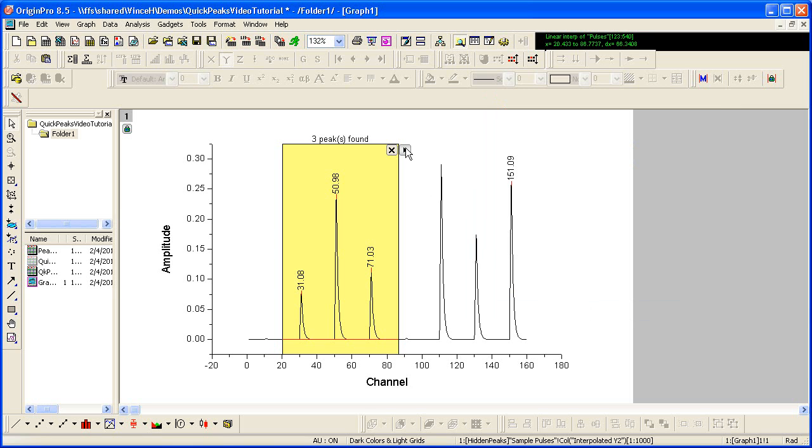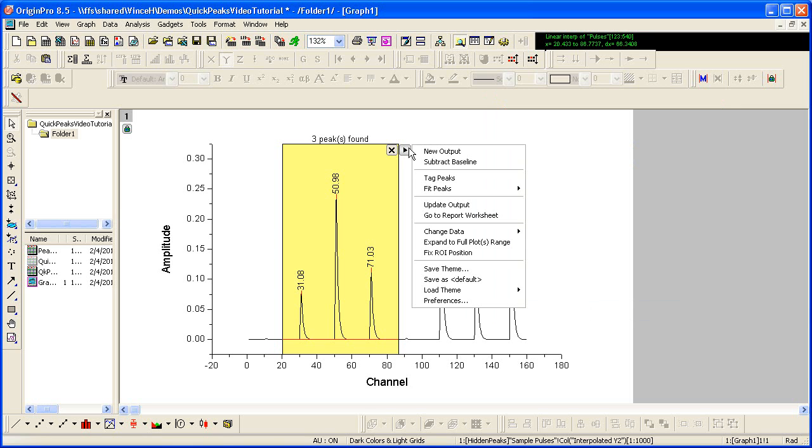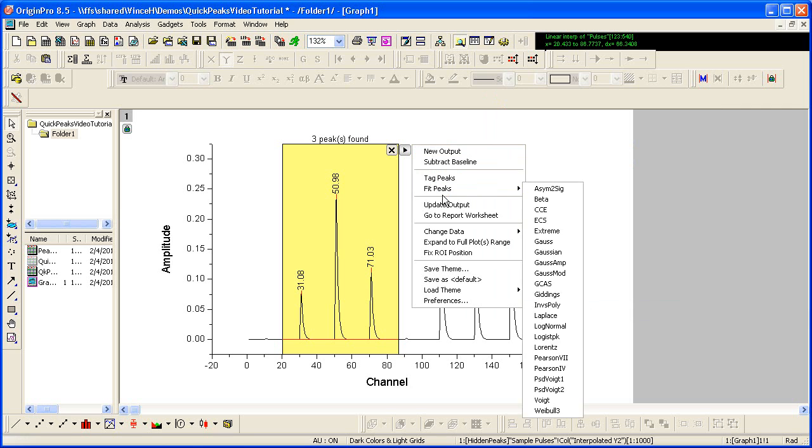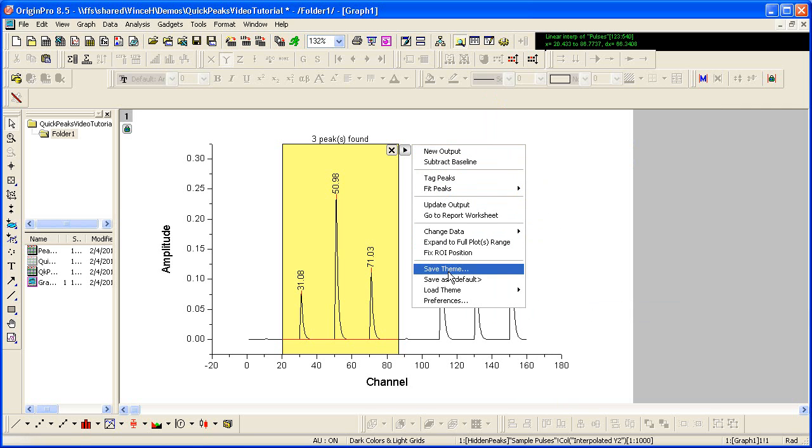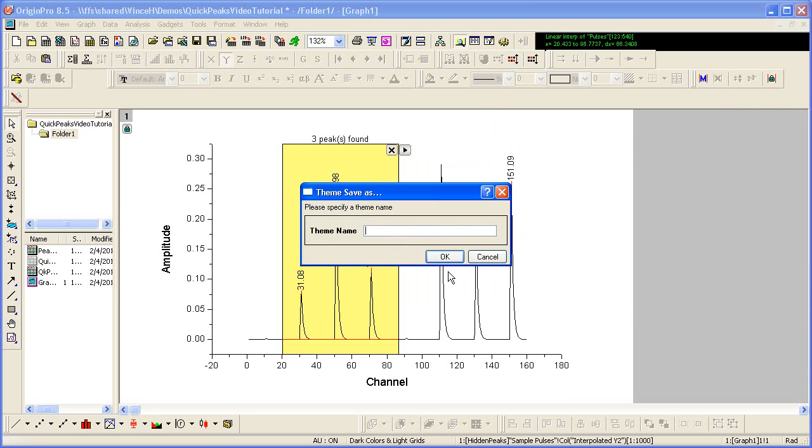I like these current settings so I can save them to a theme for use with future similar data.